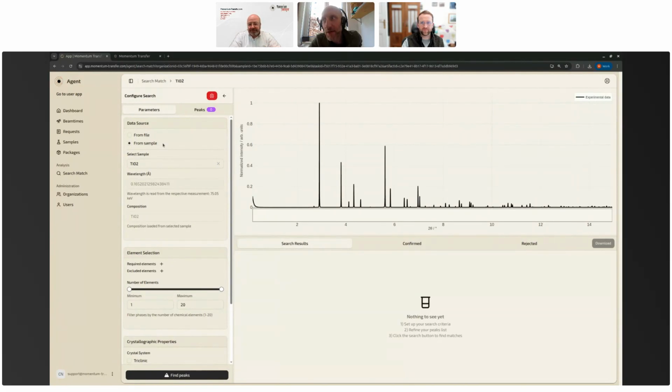Yep. So as I mentioned, right now it only connects to the Crystallography Open Database, the COD. So this is an open source structure database that has, I think, something like, Lucas, maybe 500,000 structures, roughly, maybe a bit more than that. So it's only searching from that database currently. We are planning to incorporate ICDD and possibly Materials Project and maybe some other things as well. But currently only COD is available.